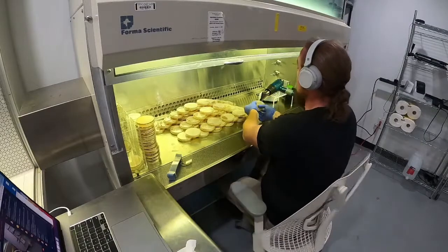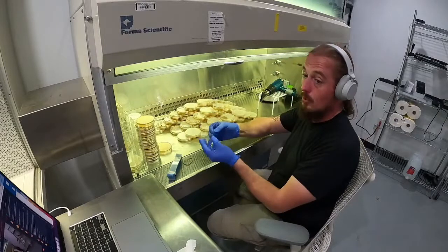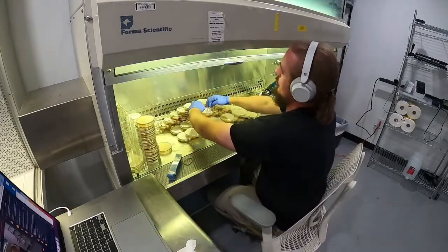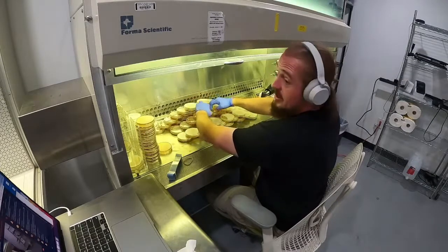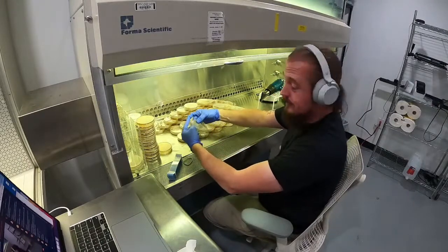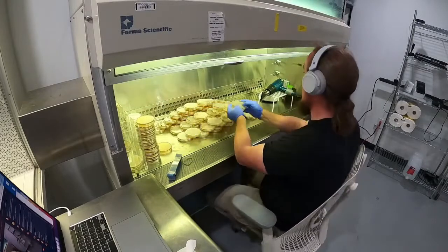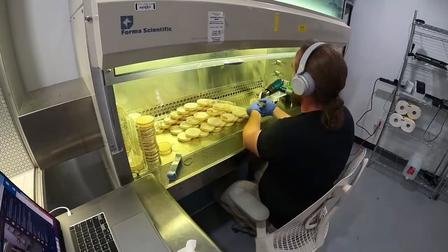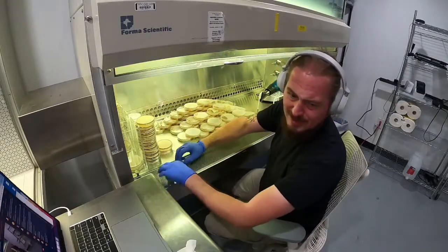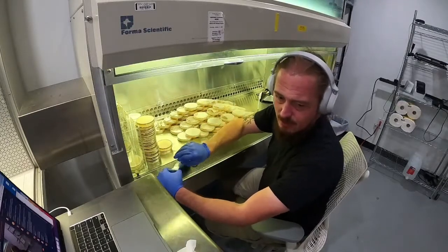So believe it or not, this actually brings us full circle to the original question. Liquid culture versus agar versus spores, right? So if you don't apply a spore syringe to grain, what do you do with it? Well, you get yourself an agar dish and you squirt 1 to 2 mL of that spore solution onto that agar dish and you wait for it to mycelate. And you'll start seeing little circular growth patterns. It's going to look super cute. Like, oh look, mommy and daddy had a little baby fungus. And the fungus is like, hey, I'm a baby fungus.